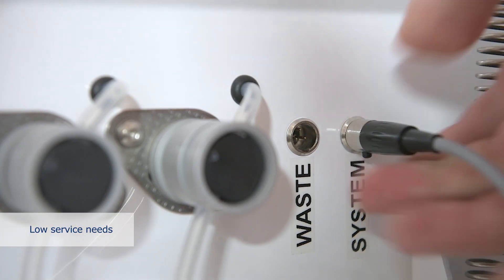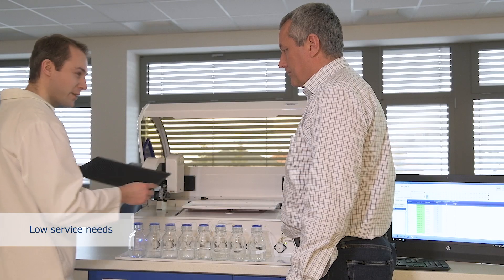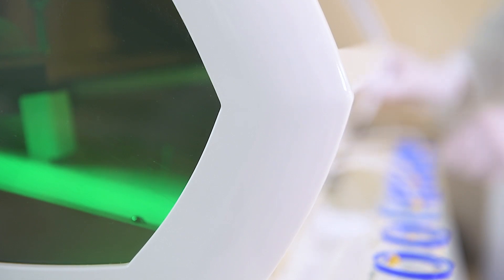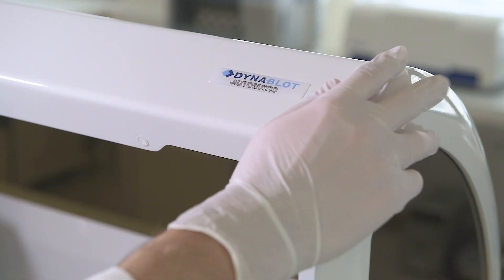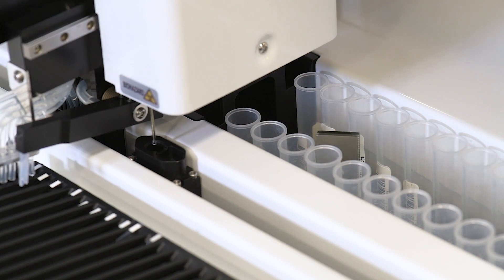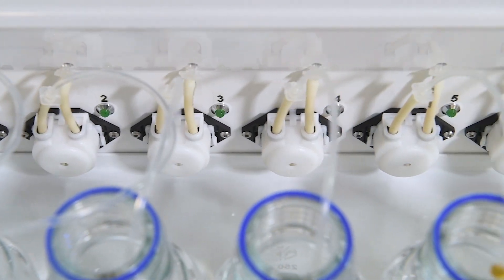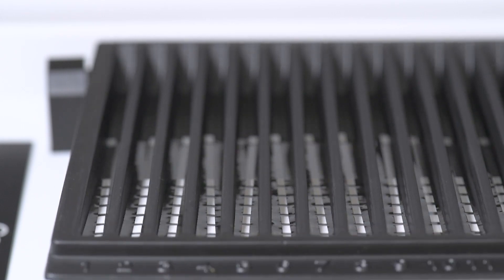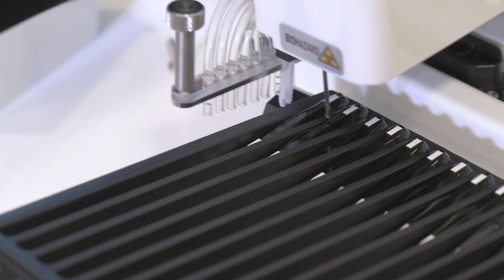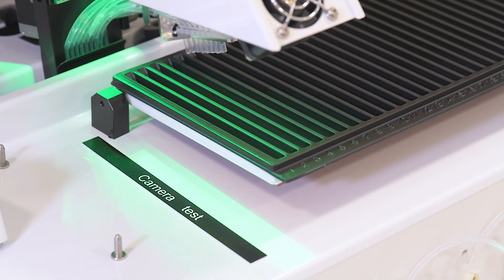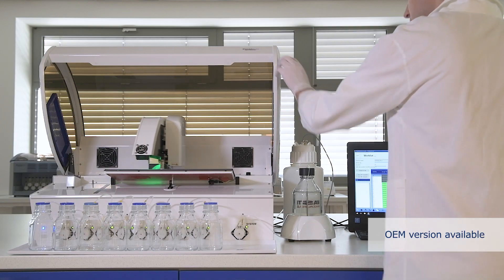Also, its installation is easy and requires just short user training. To create DynaBlot Automatic, we were uncompromising in meeting customers' needs and wishes. It achieves a design that optimizes both full automation and convenience. We've developed a robust and reliable state-of-the-art system. It marks a milestone in the evolution of DynaBlot. We are here for you.